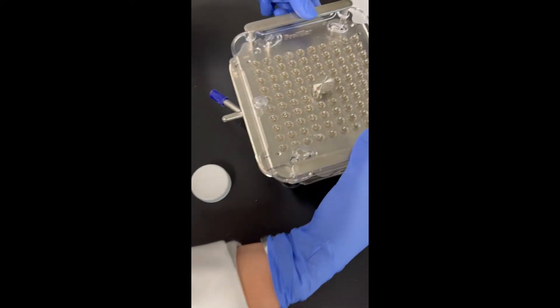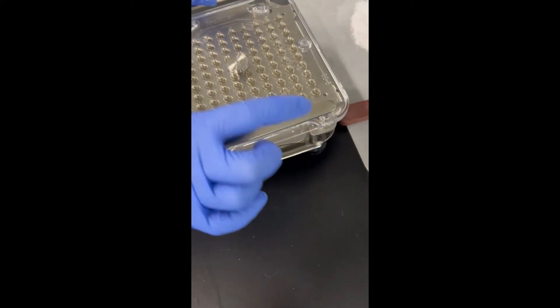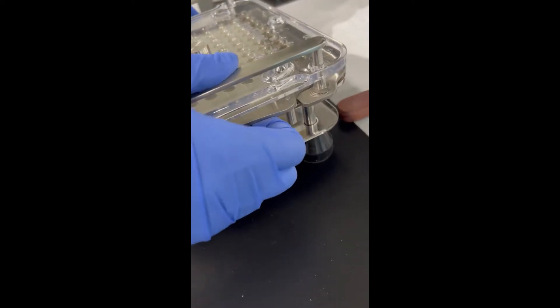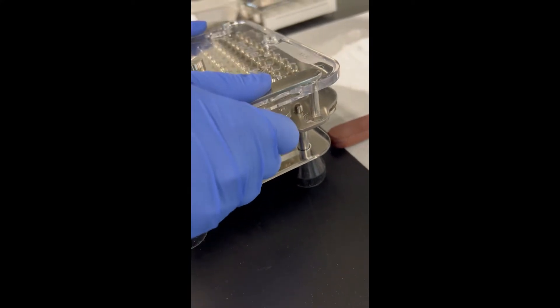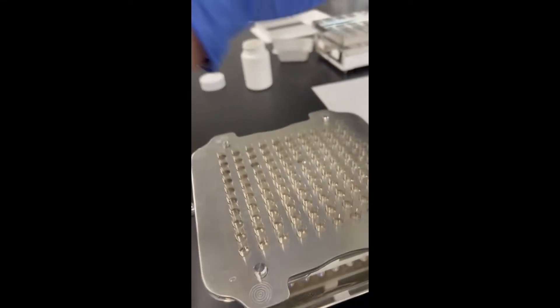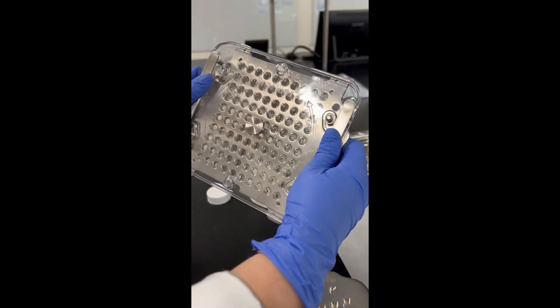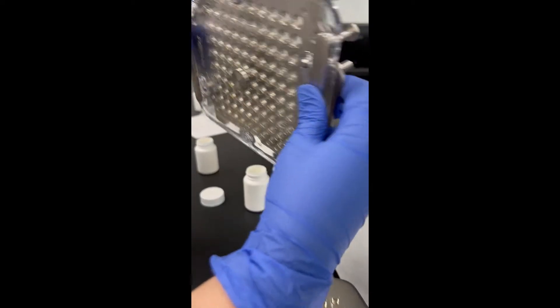Hold on to the little handles on the top piece, and then take this bottom piece and pull it straight up — you'll see it moving. All of your capsules are going to be in there, and here are all the tops. Make sure you keep this in the locked position because if you move it to unlocked, all of the cap lids are going to fall out.